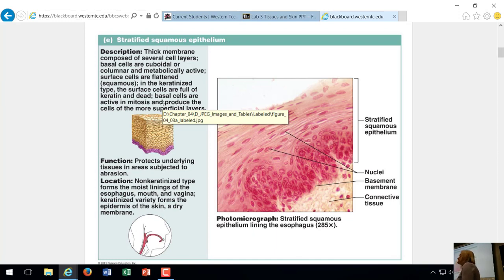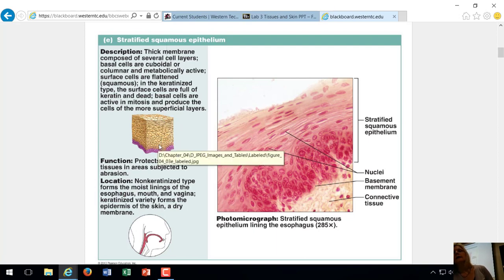Stratified squamous. Stratified means many layers of cells. So we're looking at a tissue that's made for protection. Look at how many layers we see here. This cell is going to protect against abrasion. Our skin is a really good example of stratified squamous cell. Many layers that if you rub around on your chair and on your clothes, you see a little fluffing off sometimes. That's what most of the dust in your house is, sloughed off skin cells. But it's not damaged because there's many layers below it.